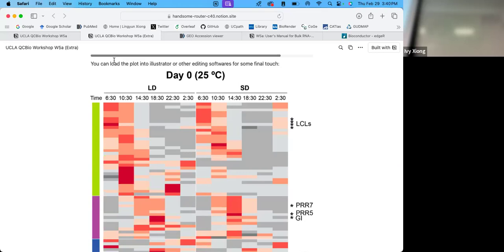Yeah, I think that's the output that we just plotted.